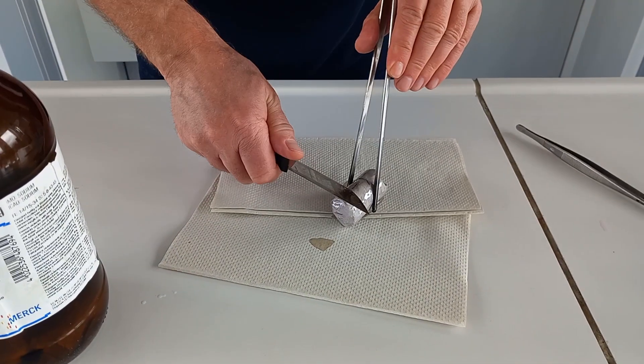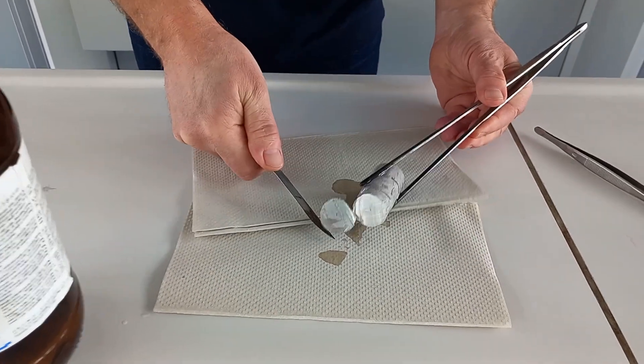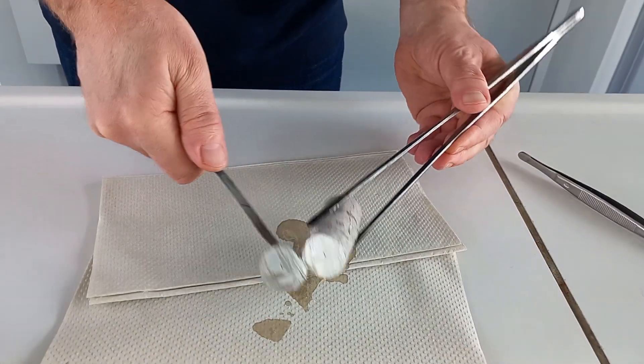Sodium is also a very soft metal, so it can be easily cut with the knife. You can see that the sodium is very shiny on the carved side.